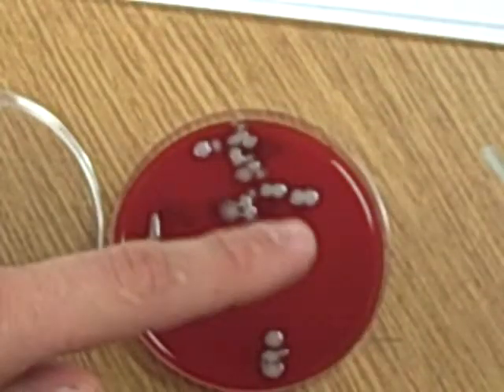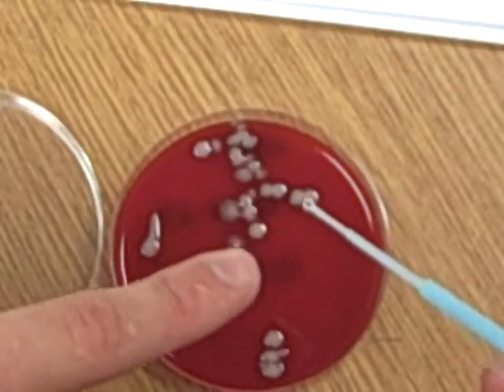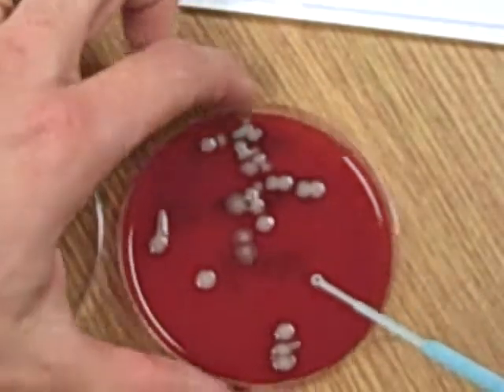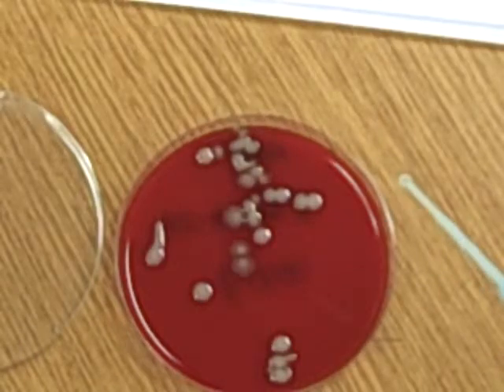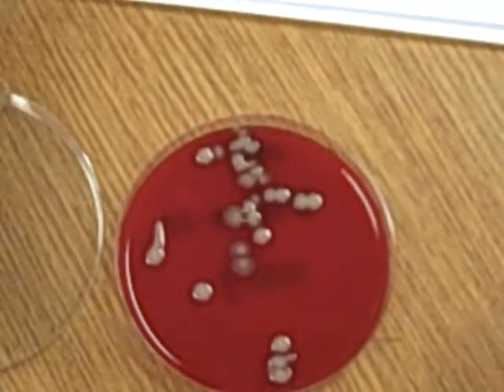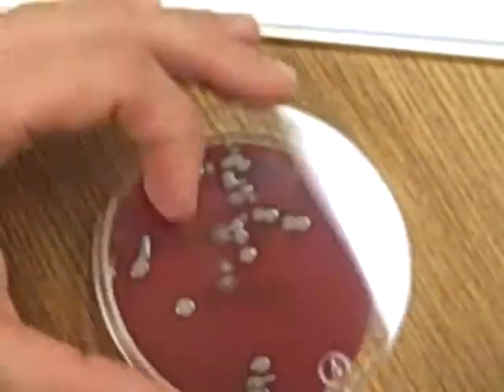Likewise, if I use the smaller loop, that's only 0.001 milliliters, every one colony that grows represents 1,000 colony forming units per milliliter.